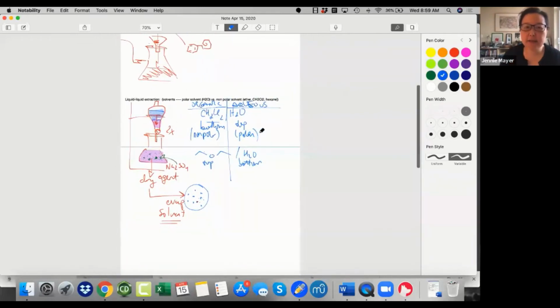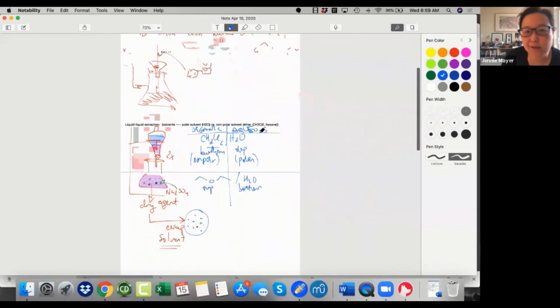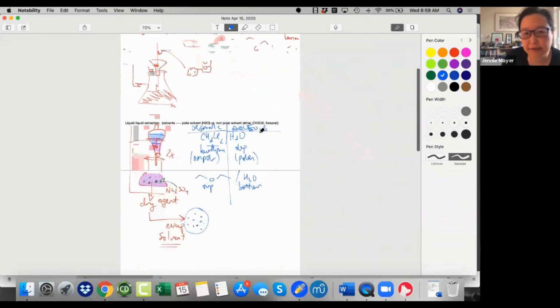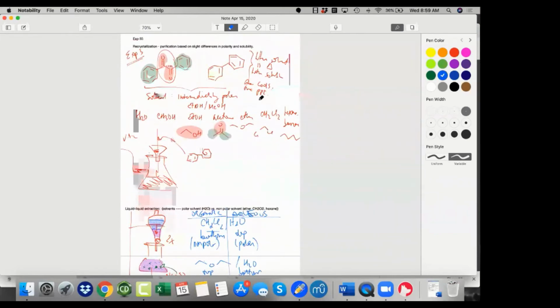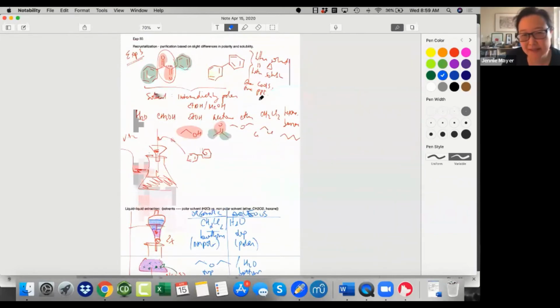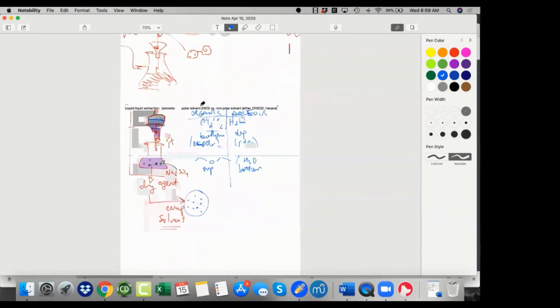And you guys can see then that there are 2 techniques we covered. When do you use one and when do you use the other? So did anyone figure that out? Recrystallization should be used for intermediately polar molecules. Mm-hmm. And then the liquid extraction is when you're dealing with non-polar and polar molecules.